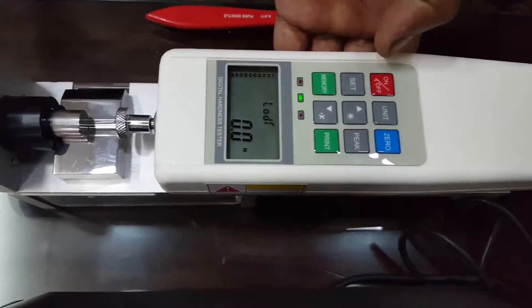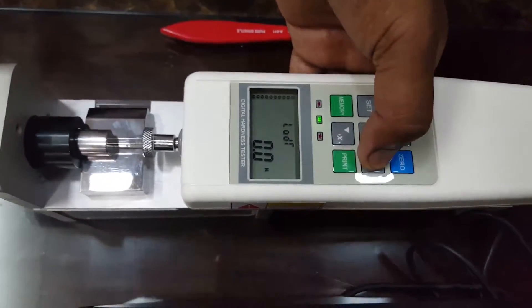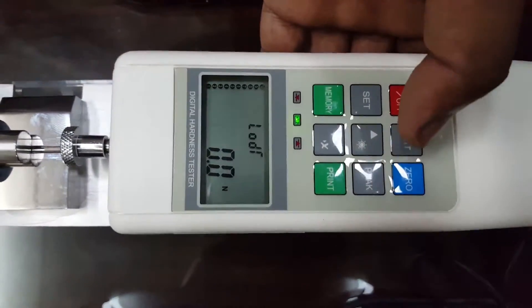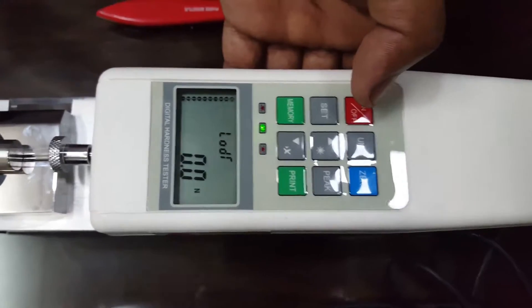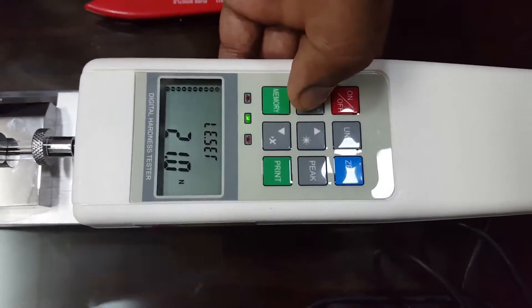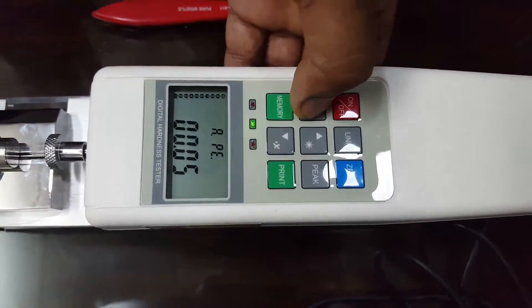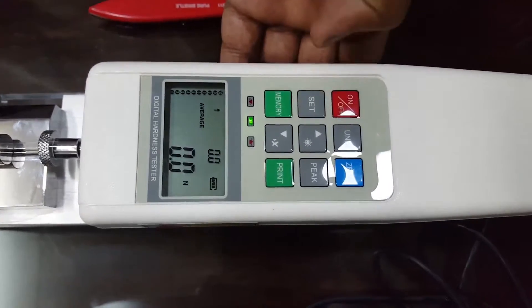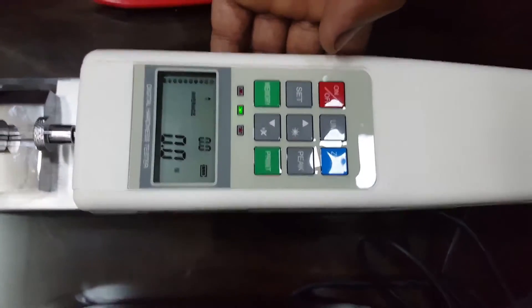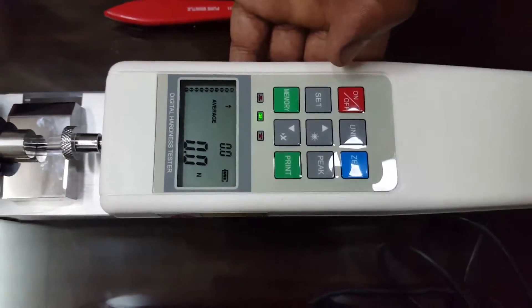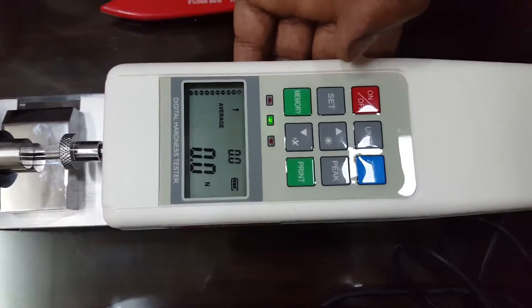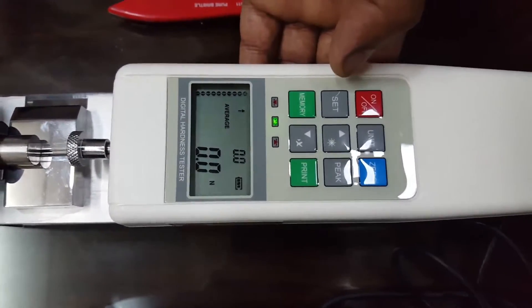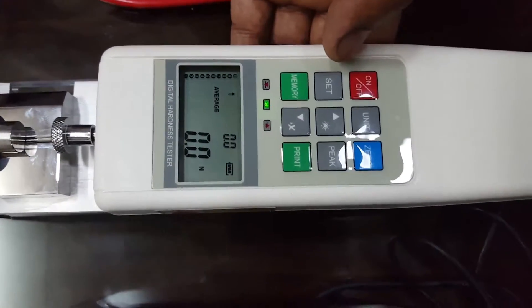Memory can store 10 memories for 10 different tablets, and it will display minimum and maximum breaking strength hardness as well as the average of all 10 tablets.